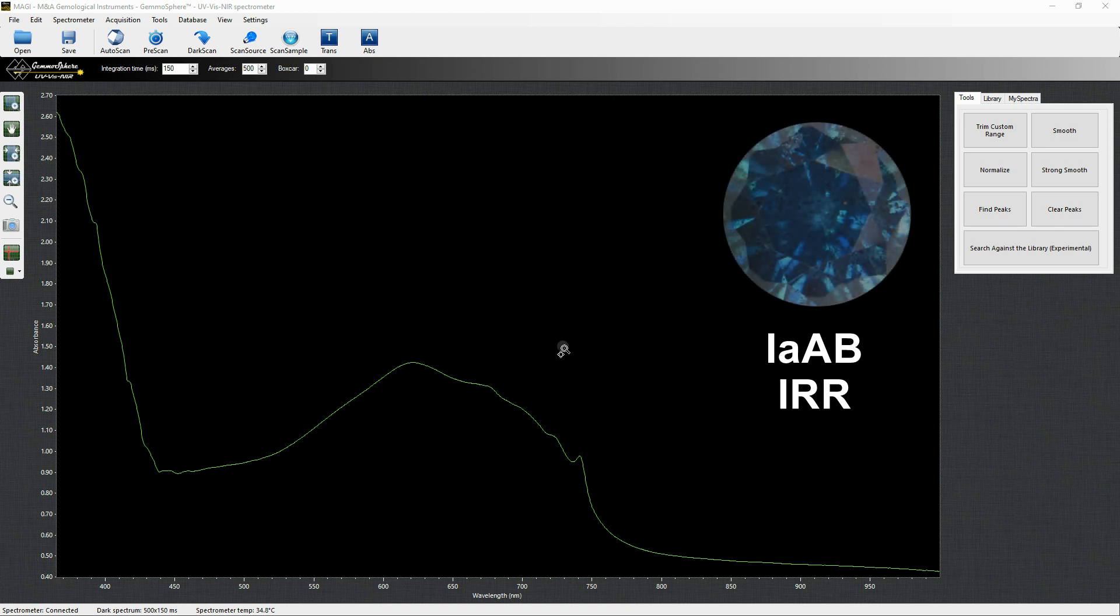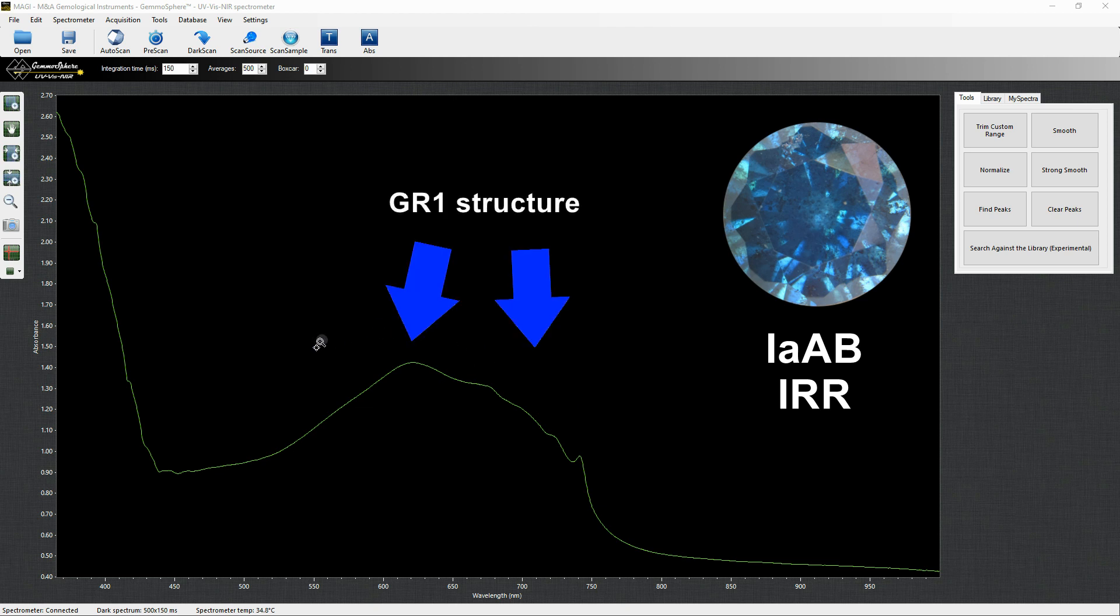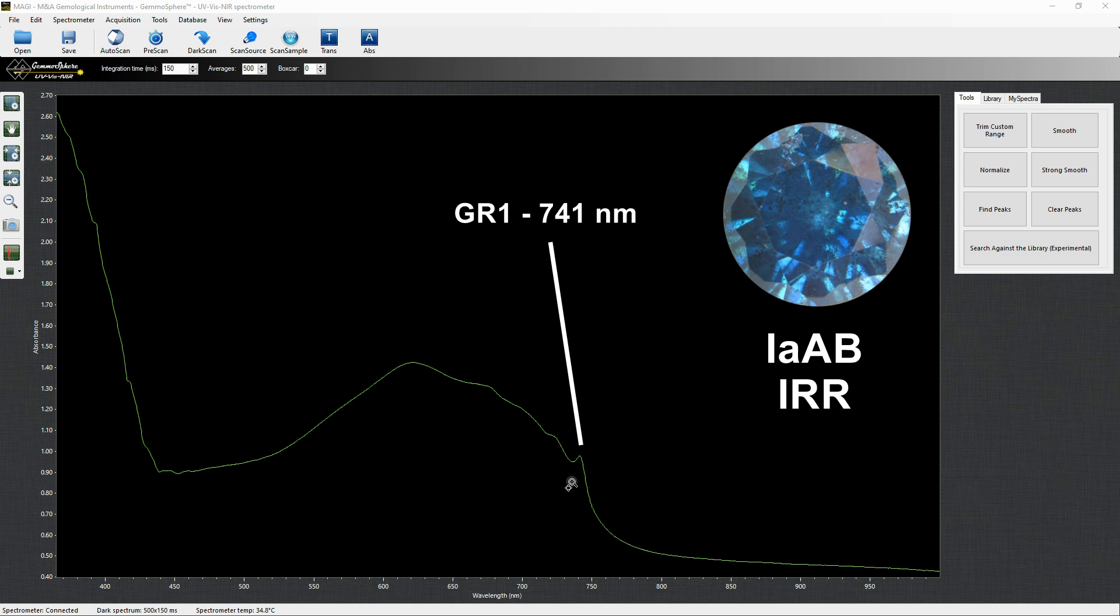Blue color can be easily obtained by irradiating specific natural type IAAB with high energy particles. The UV-Visnir spectrum displays the absorption GR1 structure with a clear peak at 741 nm generated by irradiation treatment. Sometimes even peak caused by N3 aggregate can be spotted. Since natural type IIb do not contain nitrogen, this spectrum is diagnostic of the artificial origin of the blue color.